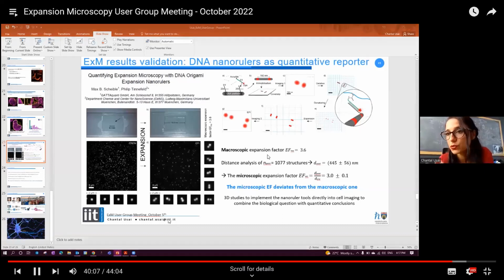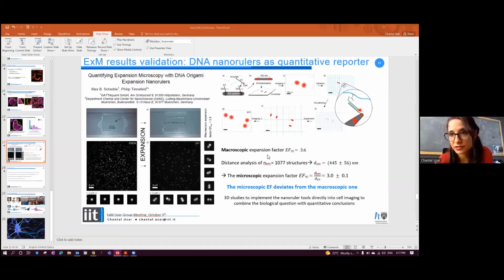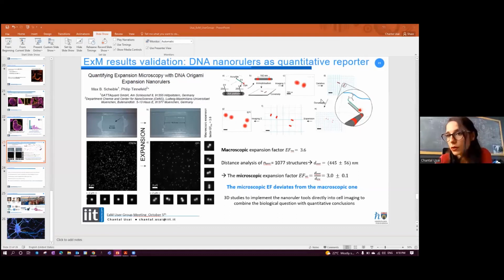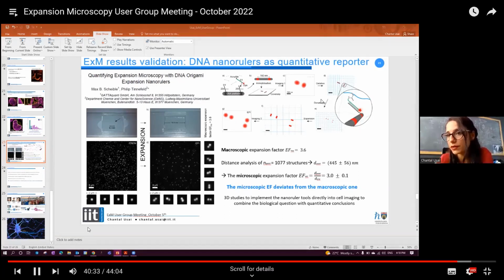But between the cover slip and the gel itself, there is nothing, you image the gel on the cover slip. So that's what we do. For the not yet fully expanded gel, we just do the imaging on the cover slip. For example, before expansion, since afterwards we want to expand it, we just image on the cover slip mounted in a metal ring with PBS on top.